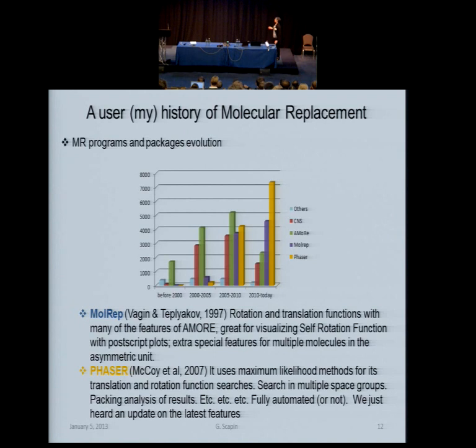Not long after MoRep, Phaser came along, and since then I've been using it as my molecular replacement program by default. I tend to think that if it doesn't work in Phaser, it won't work anywhere else. It might not be true, but that's my modus operandi. And it helped me in a lot of different cases, in a lot of difficult cases. One of them was a very important program.